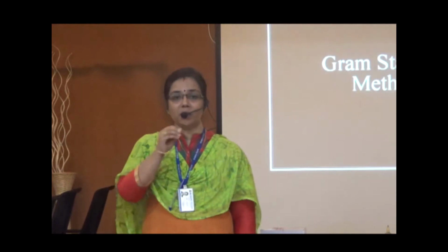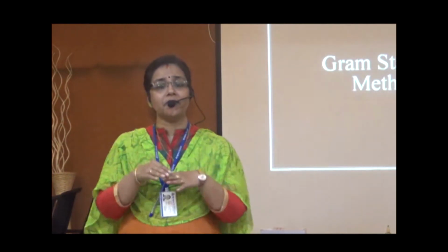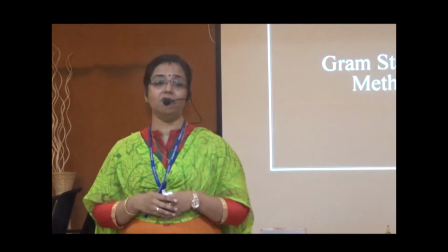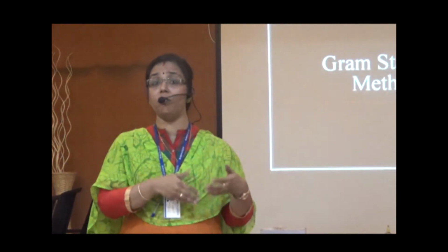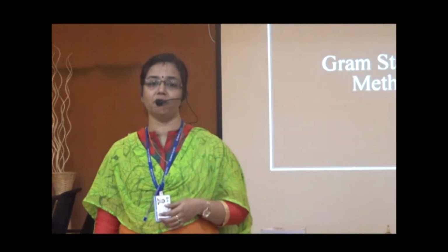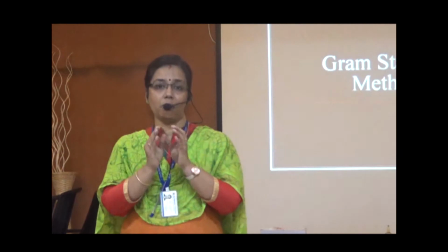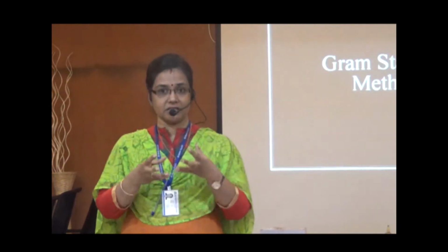I already said microorganisms are too small and not visible to our naked eye. So for the observation of such microorganisms, we need special techniques and also special instruments. For this observation, we use the instrument called the microscope, ranging from the simple compound microscope to the electron microscope, the latest version, which we also use for observation of microorganisms. But it is too difficult to observe a microorganism using a simple compound microscope. To solve this problem, we use special techniques to observe such microorganisms.